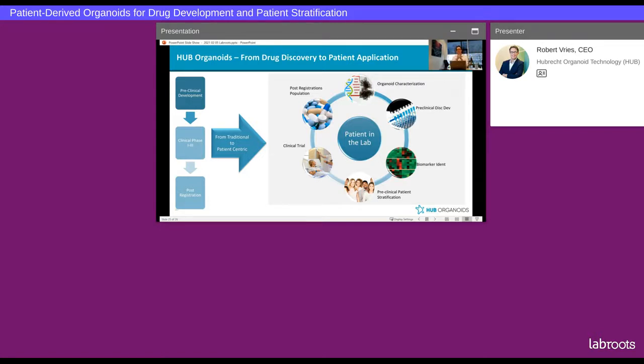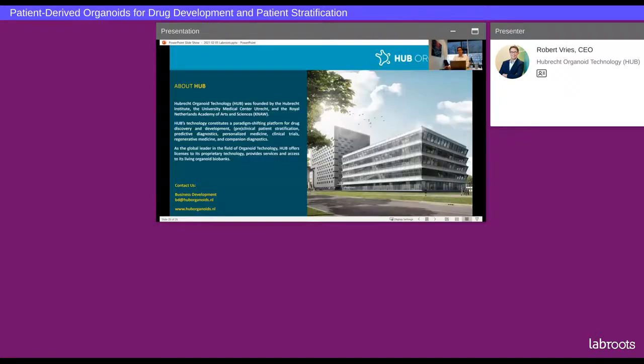And so this picture indicates in a circle, as opposed to on the left a more traditional development from chemistry to cell lines to animal models to clinical trials, which leads to this failure to respond and cost inefficiency in the development of drugs. Because in the circle, we can now connect the patients to the preclinical work. We basically have a system that allows us to test both clinically and preclinically the same type of patients, the same patient group, and it allows us to integrate the data, but also hopefully to much more efficiently develop new treatments.